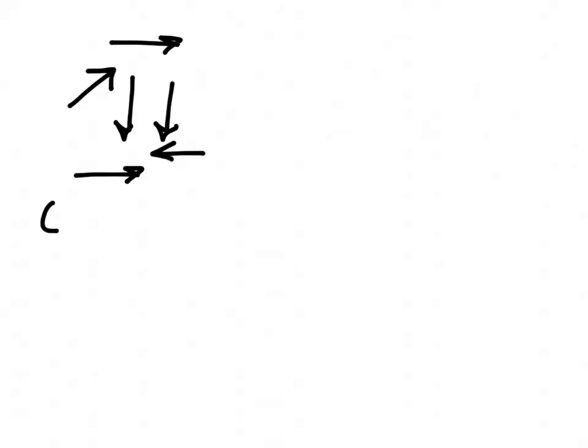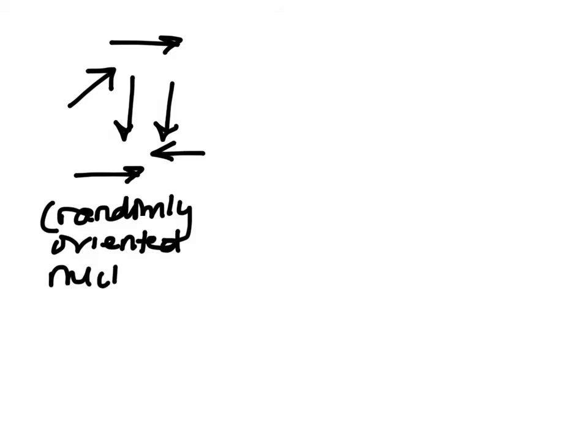If we were to take these randomly oriented nuclei, and then apply a magnetic field.